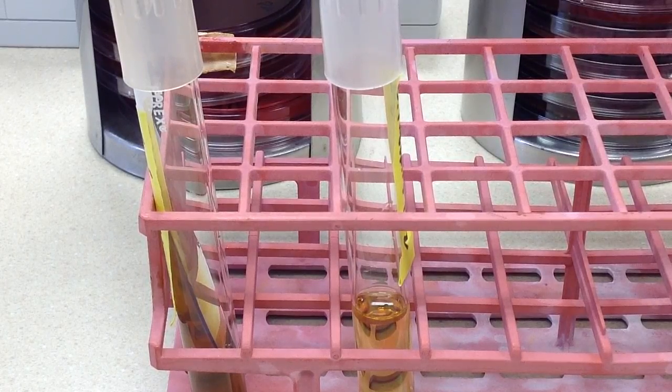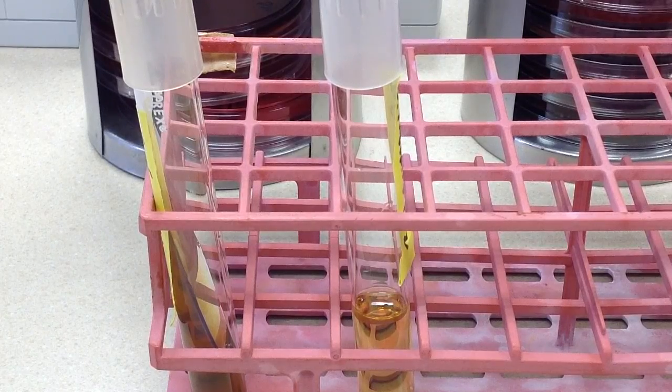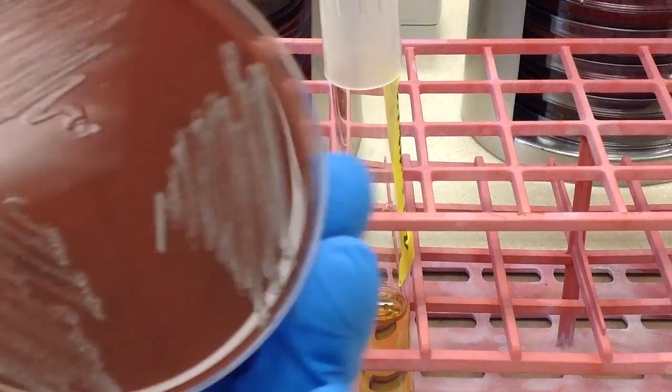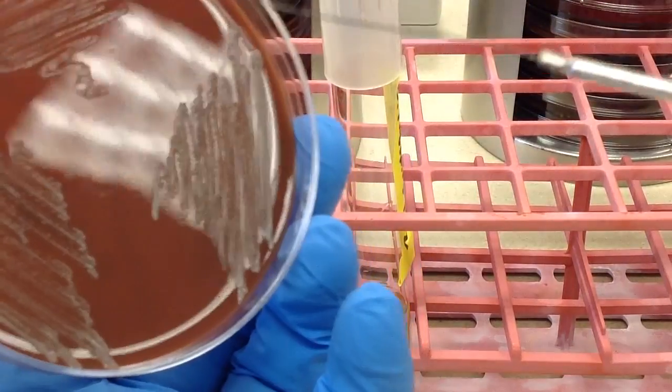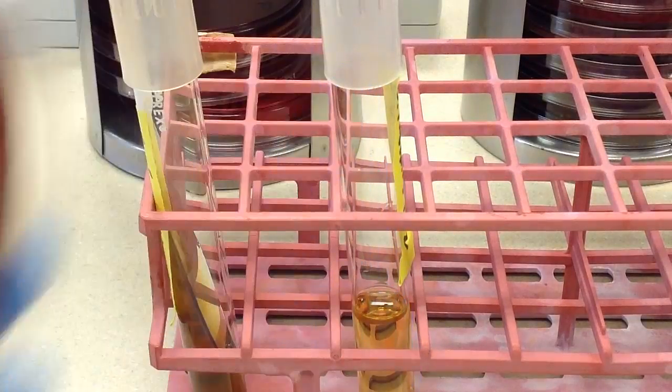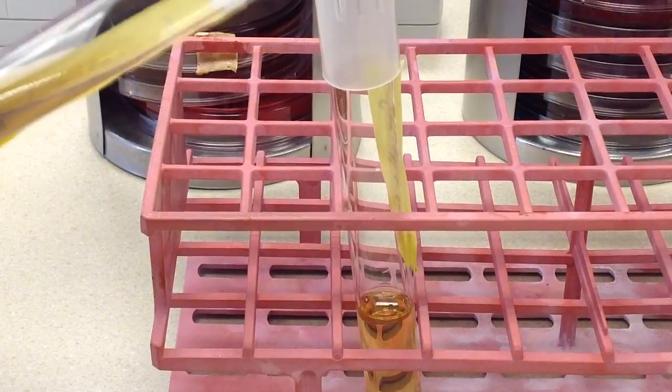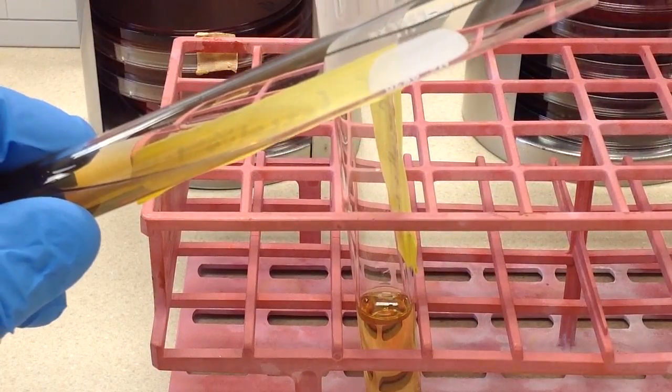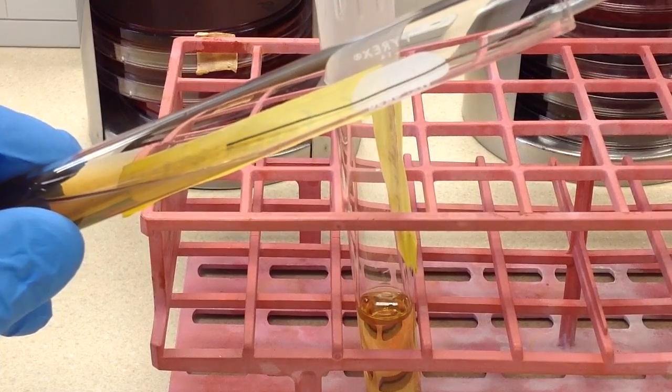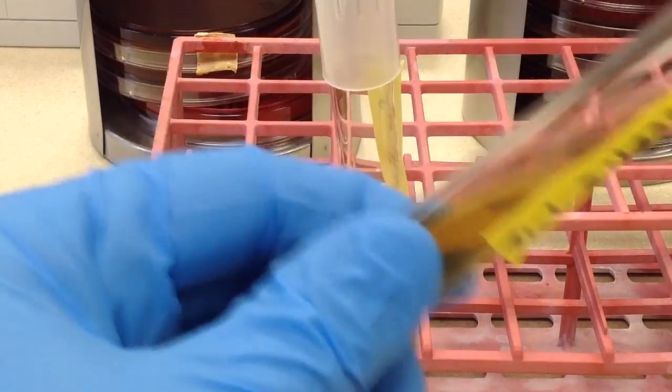First of all, when we do a slant, all we are inoculating is the face of the slant. So, I am just going to go ahead here and take a little bit of my stock organism, Enterococcus, and then all I am going to do is just run that needle along the face of that slant.